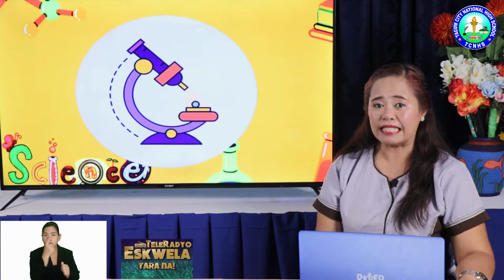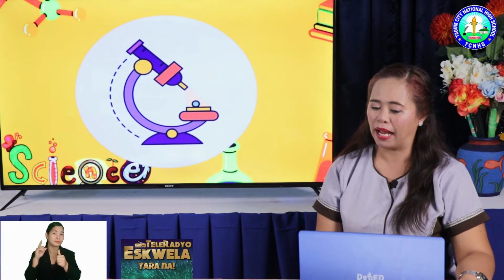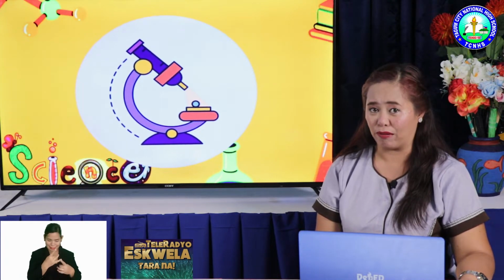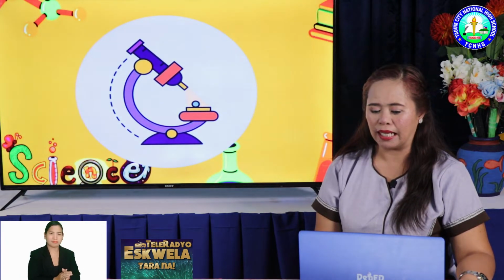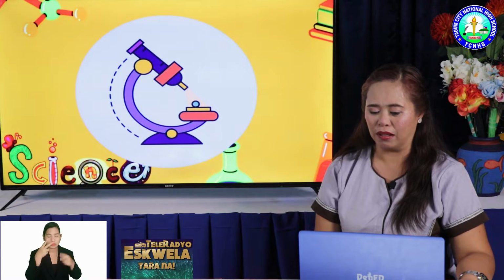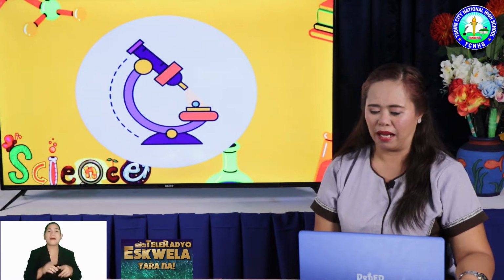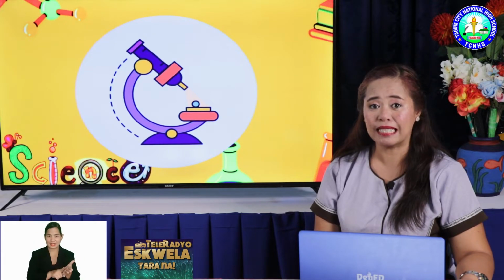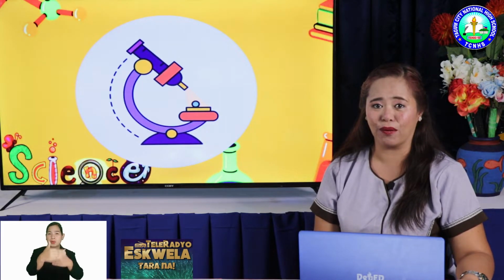When you first see a microscope, you might get too excited to look through the eyepiece. However, you might end up disappointed about seeing a dark view. Do not worry, because in this lesson, proper procedures are kept simple yet detailed for you.